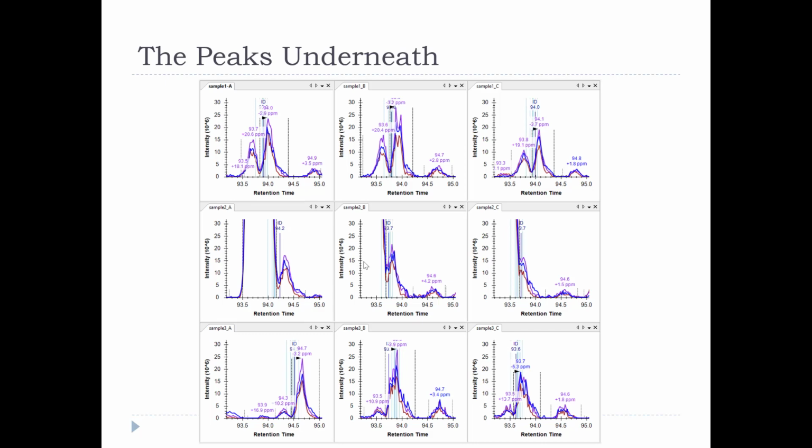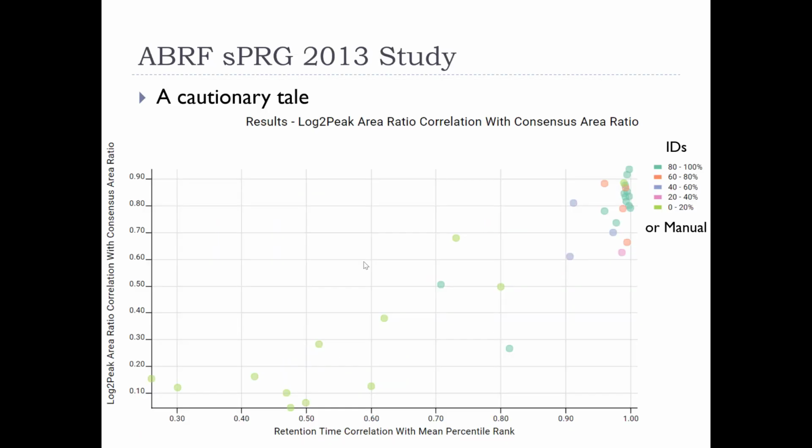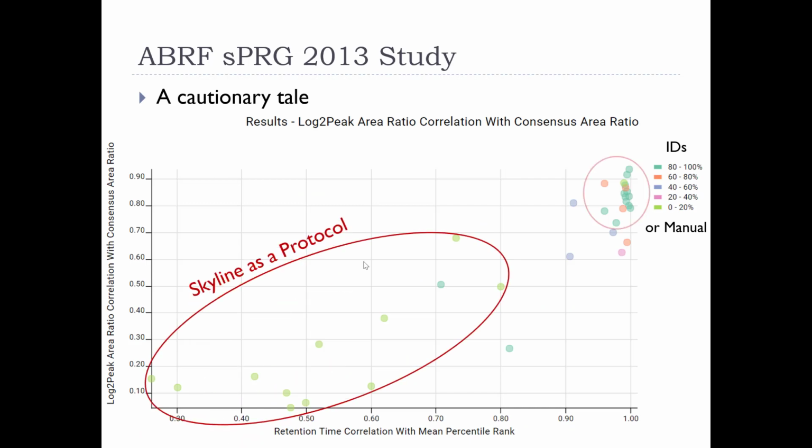But the fact that you can look at it and figure this out gives you a chance to say, okay, I'm not going to order a synthetic peptide for this, because you can see this is 20 million, this is 20 million, so it's staying pretty consistent all the way through. Not a biomarker, it's just a false discovery. Okay, I'm going to skip this.